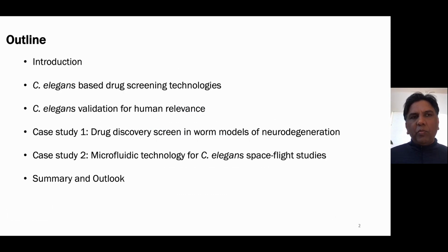In terms of the outline of my presentation, I'm just going to give you a quick overview of C. elegans and some of the challenges in terms of drug discovery. Then I'm going to go into technologies that have been used for high throughput C. elegans screening, and then focus on some specific examples that will give you an impression of how data in C. elegans can be used to translate to human studies.